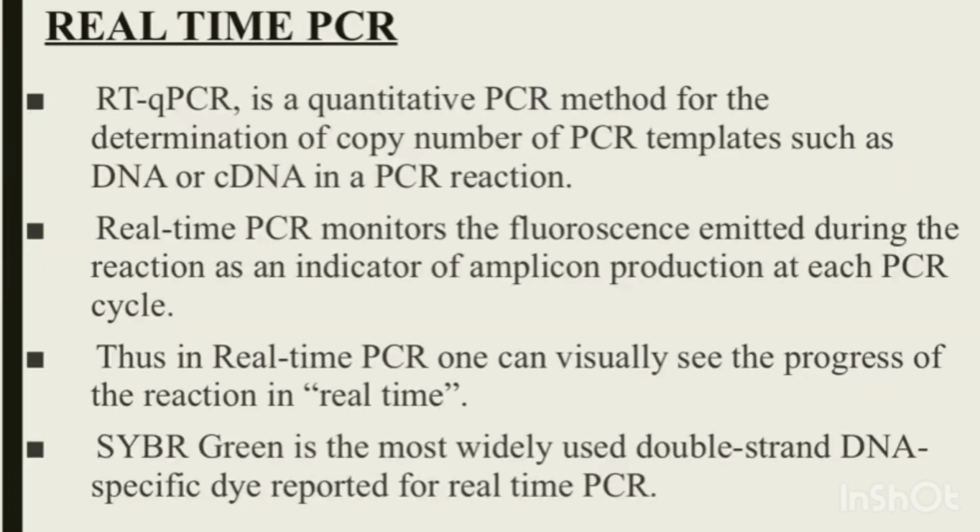So coming to next type of PCR is real-time PCR. That is RT-qPCR, a quantitative PCR method for the determination of copy number of PCR templates such as DNA or cDNA in a PCR reaction. Basically we are using SYBR Green as the most widely used double-stranded DNA dye.